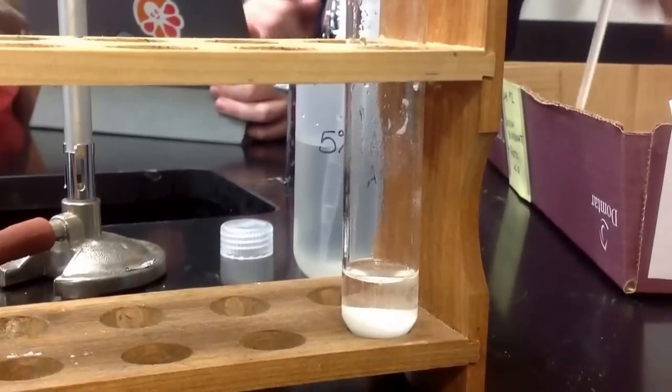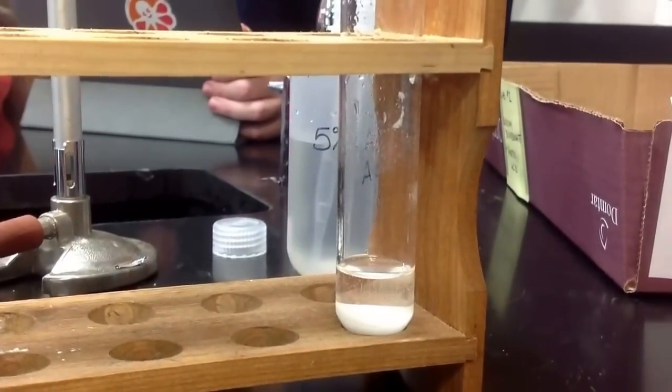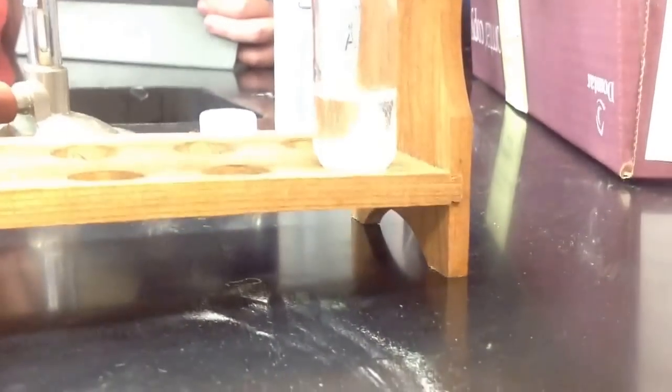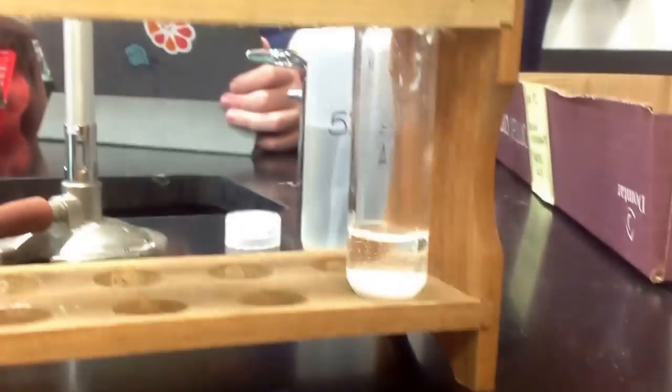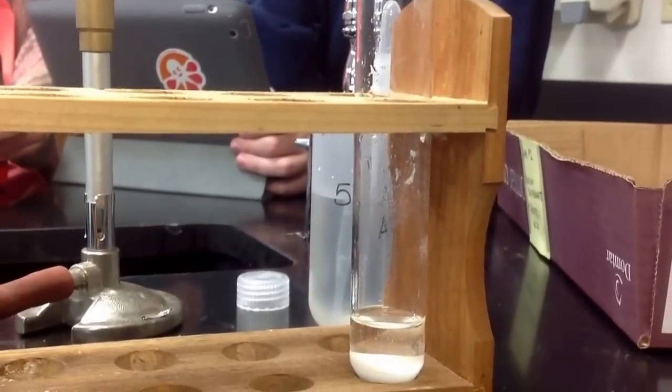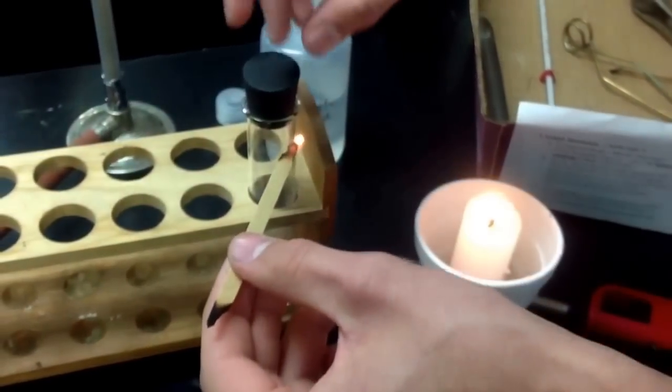Now, how do you think we can check the flammability of the gas that is being produced? Hold it up over this and create a spark. Stopper it first. Try to take this off right.